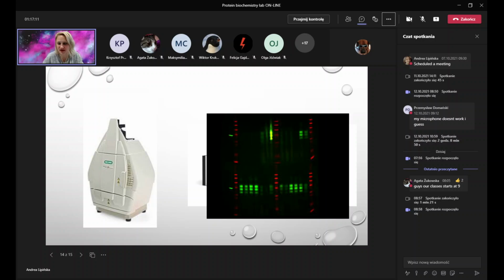And so the last thing I just wanted to show is this part of the experiment that you will not see just because of the time frames. But actually you could do it because you're starting a little bit later. So this is the preparation of the bacteria for lysis. So the DH5 alpha, which are overexpressing GST-CD81 LEL.